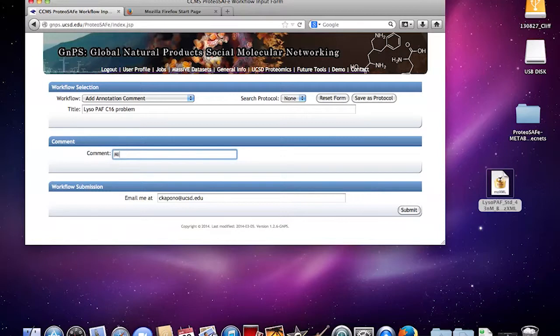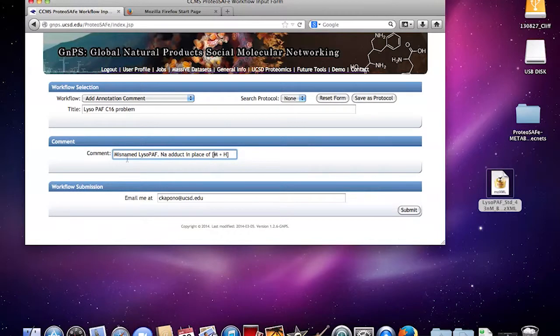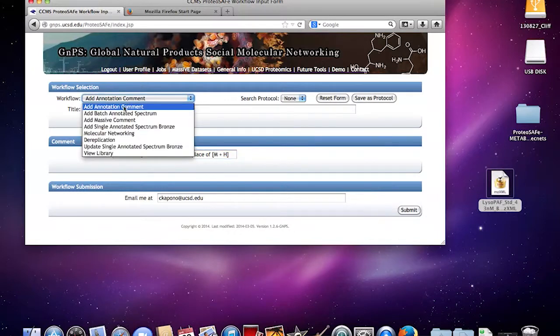Then you can comment on whatever happened. You can say misnamed Lyso PAF C16 problem and then correct sodium adduct in place of M plus H. Something like that. So you can comment on it after and submit it. There's also a way to comment on annotations as well.